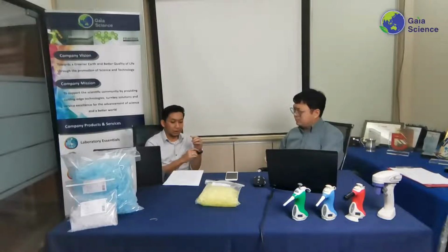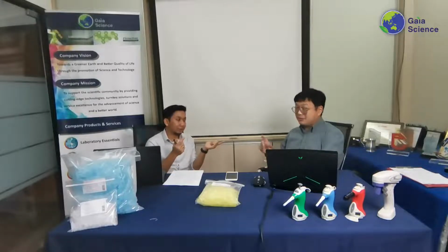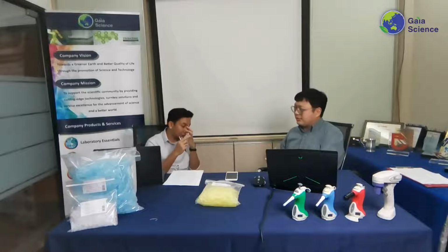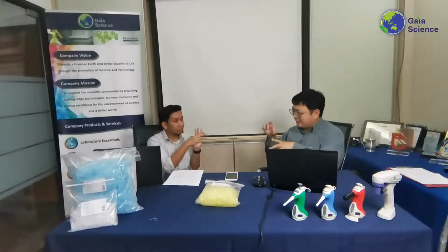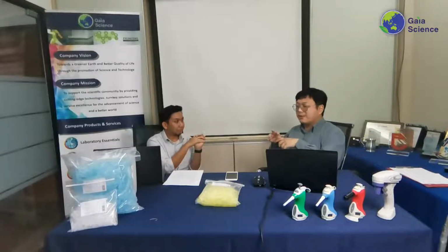And just to wrap up, as mentioned earlier, the filtered pipette tips you cannot autoclave because you don't want them to get wet. The bulk ones are okay, but again, as I was saying, there can be problems with the shape and size being affected. But that doesn't mean you cannot autoclave the bulk tips.